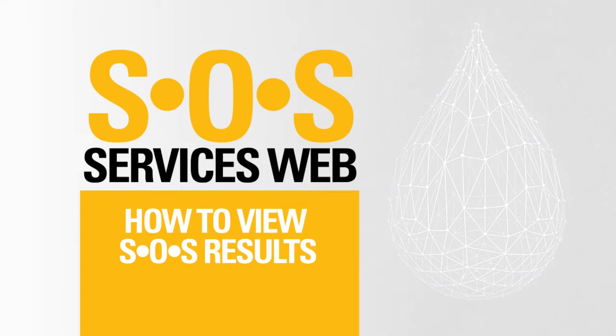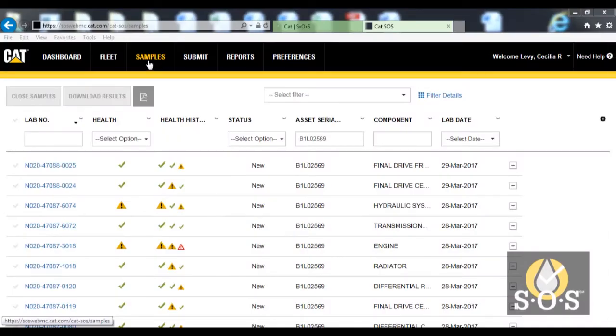to the SOS Services web tool. In this module, we will provide an overview for how to view your test results from the Samples page. We will also review the dashboard, reports, and preferences pages.